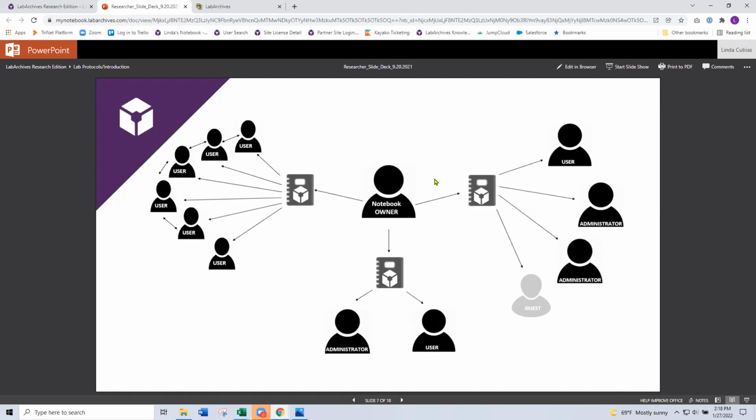Then this other notebook could be set up as a lab-based notebook, where some teams will decide on one notebook for all lab business and lab notes. So for example, each user has access to that notebook, but they're putting their data into specific sections. Jenny is going to put all of her data in the Jenny notebook, in the Jenny folder, as are Angela and Brad, for example.